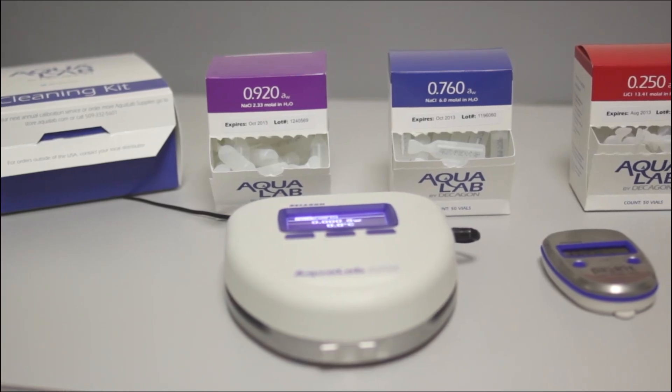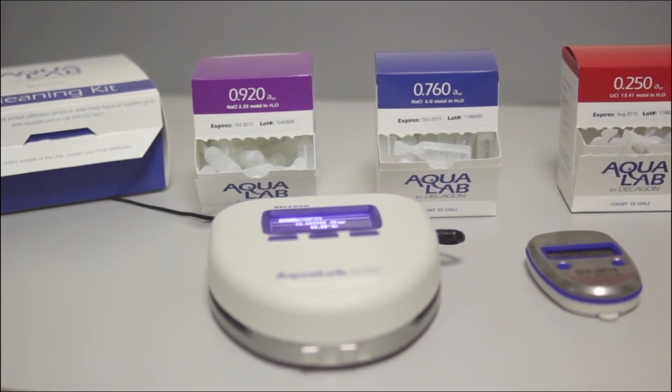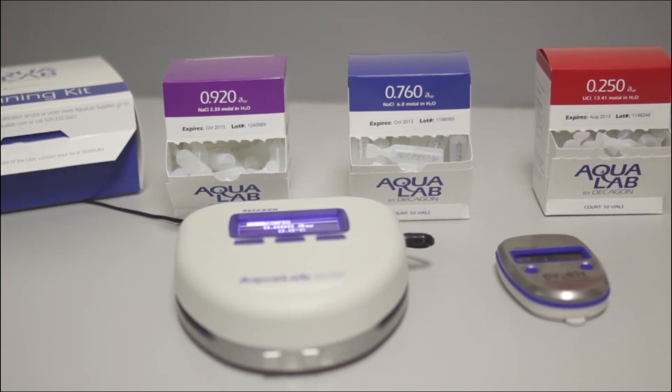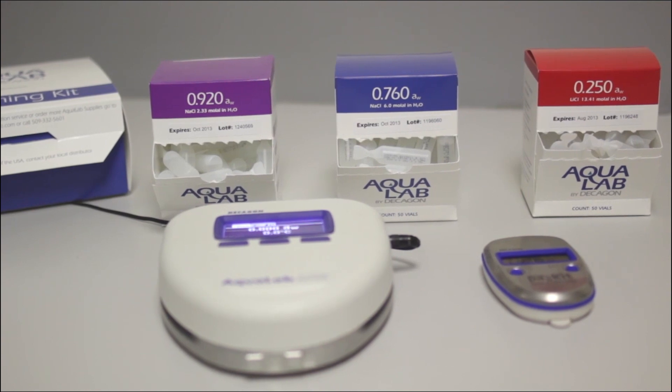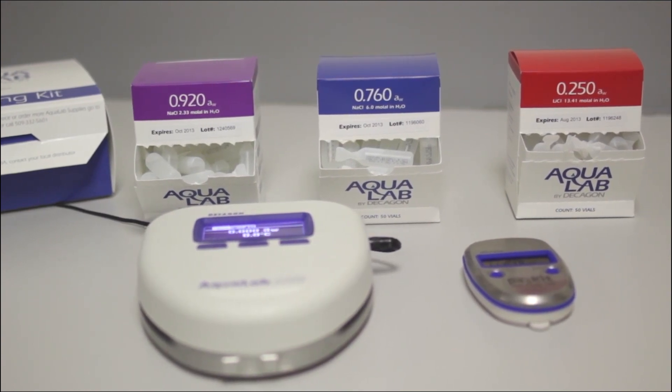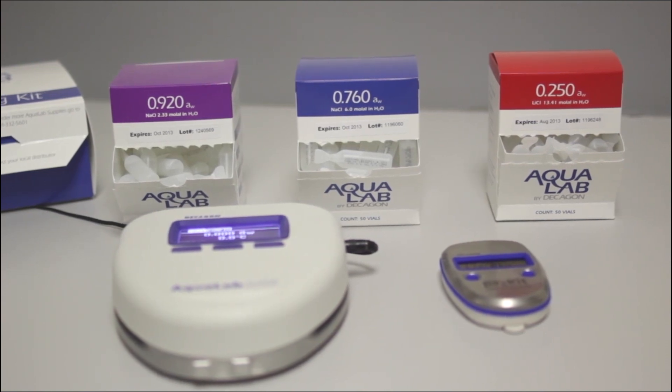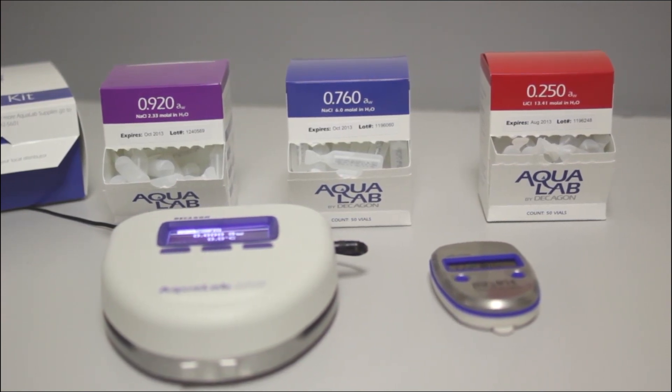After cleaning and before testing product, you need to verify your instrument with two verification standards. With the Pocket and the Light, there are only three verification standards out of the six we sell that you should use. The three standards are the .920, the .760, and the .250.